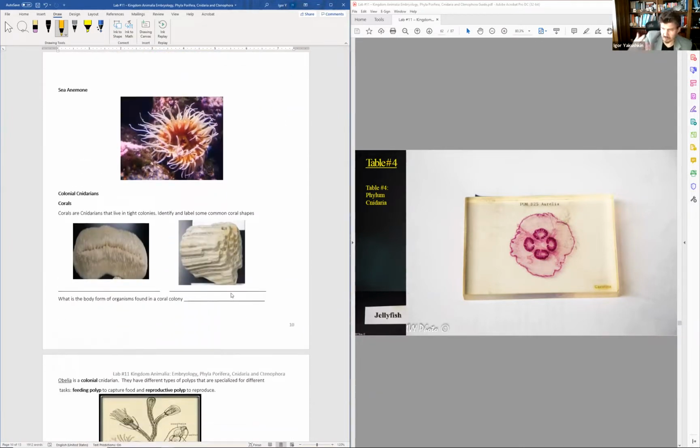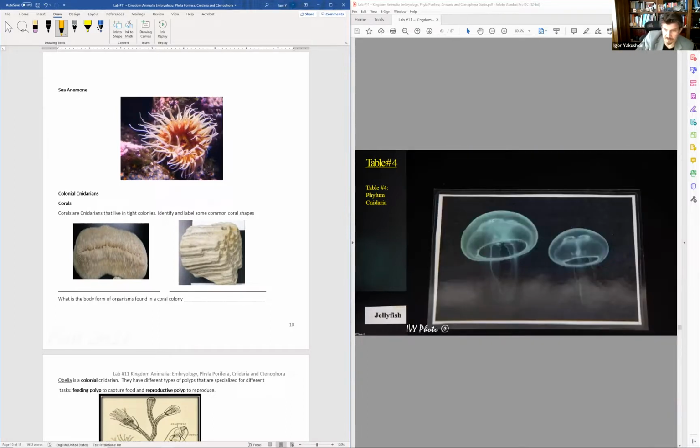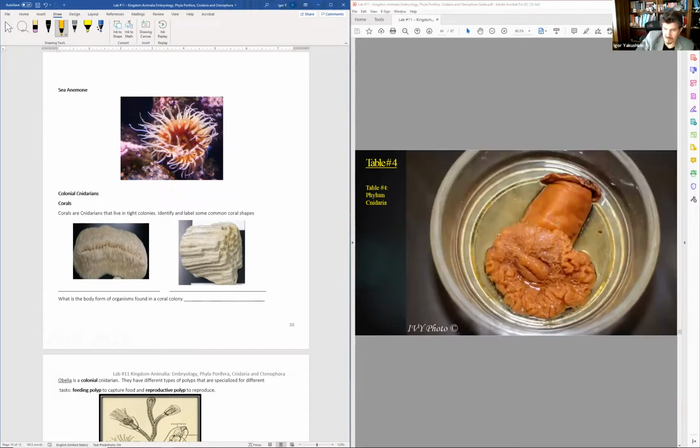If you ever went to the aquarium restaurants, they have the Aurelia in one of the fish tanks, and they are glowing, kind of a bluish glow when you are in ultraviolet. So you are shining the black light at them, and they start glowing. Kind of neat creatures. So yeah, here we go. This is exactly what we're talking about.